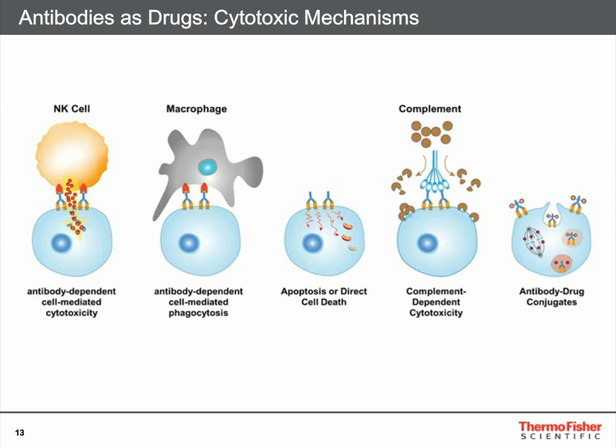Their effectiveness as drugs can be changed by modifying them. This can be good and bad, but both pharmaceutical companies and regulatory agencies are very interested in understanding and controlling the exact structure of antibodies, how minor tweaks to their structure have profound changes to their function.